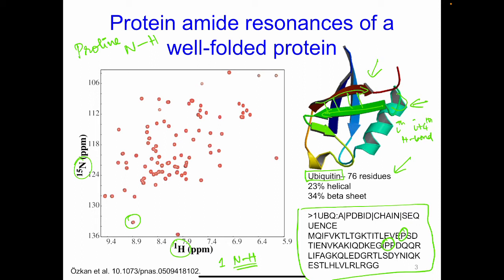So in theory, if you have a 76 residue protein, you're expecting 76 minus 3, where 3 are prolines, about 73 peaks that are going to be present. In addition to the NH, in this case, you'll also see NH2 resonances that come from asparagine and glutamine residues. These have a CONH2, and for a given nitrogen chemical shift, you see two proton resonances that are present.